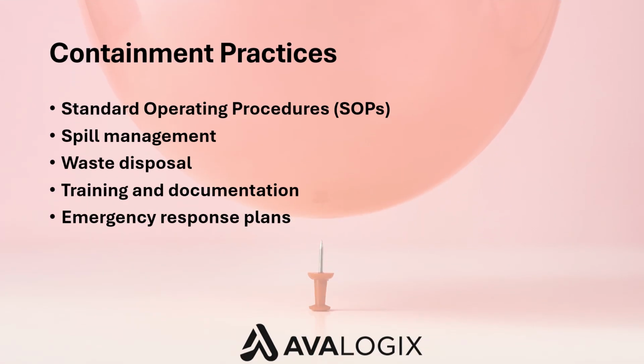Containment is not just about having the right equipment, it's also about having the right practices in place. These include writing and strictly following standard operating procedures, SOPs, for every aspect of lab work, from how to enter and exit, to what to do if there's a spill or exposure. Good record keeping is also essential.